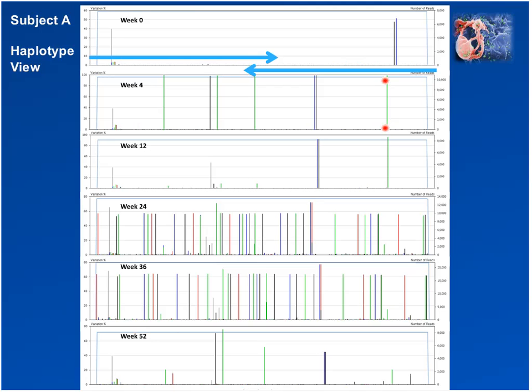And if that bar extends all the way to the top, that is an indication that that difference from the reference is there in all the sequences in the alignment. If, by contrast, that bar only extends up to approximately the 60% line, that means only 60% of the sequences below in the alignment contain that difference, and the rest match the reference. And so on. You can see that there are bars, in some cases, of differing heights.